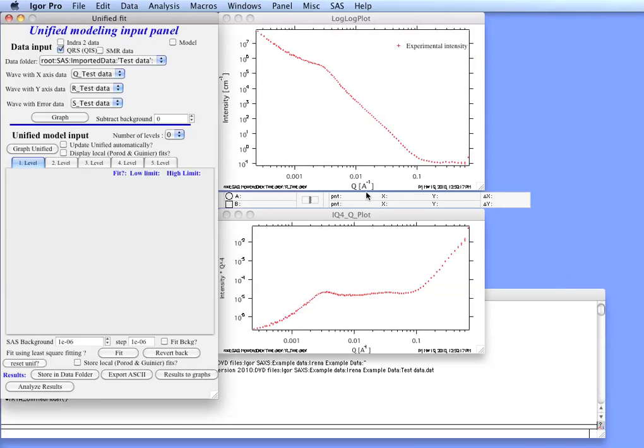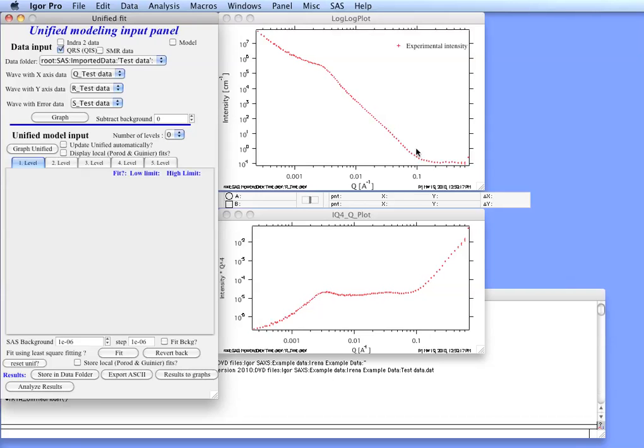As you can see, this system composes of fine stuff which you can see easily here and a little bit worse here. And then you can see large stuff and then you can see some power law slope at low Q. In Unified Fit you have to model the data starting from the finest stuff, from the highest Q. This is a background. That's fine stuff here. So the first level has to represent these.